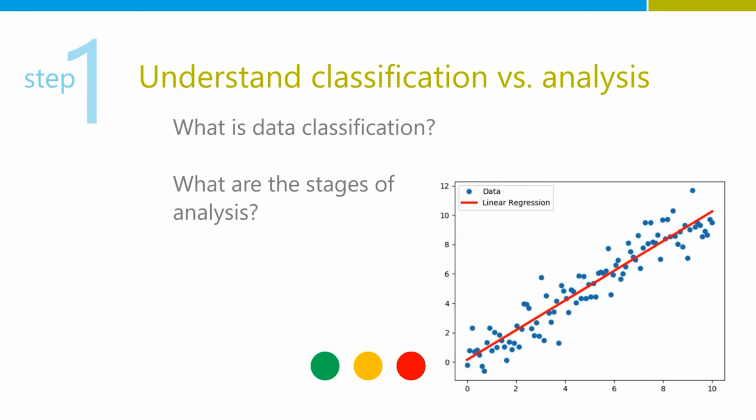And that means maybe you have a data point that was classified as bad, and then another sort of related data point was classified as good. Once you look at those together as a whole, you might say, hey, the one that's classified as bad, we don't care so much about that. So we're going to say at this stage, everything's okay. Or you might say that one data point in conjunction with the other one being good puts you in a different state that you need to look at.